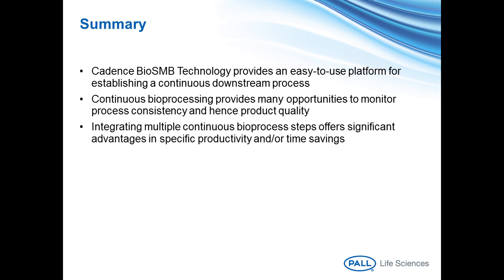Okay, so thank you. We've got some very interesting questions from the audience. One of them is related to the data that is being collected on the system. Can you comment on how the data is actually organized if you run multiple cycles on the BioSMB? How is that collected, all that information, all that raw data? Okay, so the BioSMB is collecting data all the time. So we just generate one large file with all that data, and it's all time-stamped, and then it's very easy to sift through that data and find out all the different parameters and monitor all the sensors together.